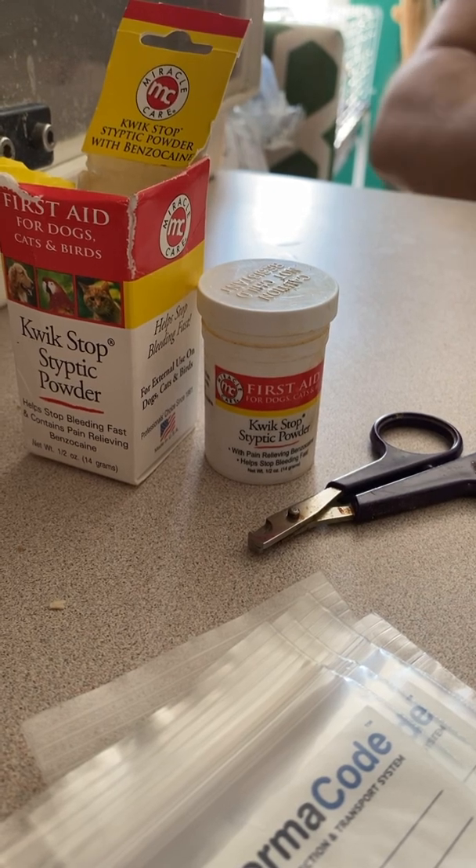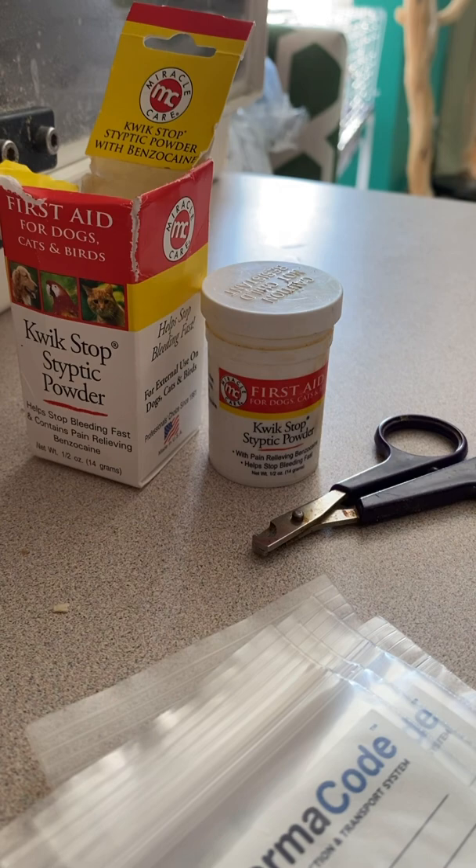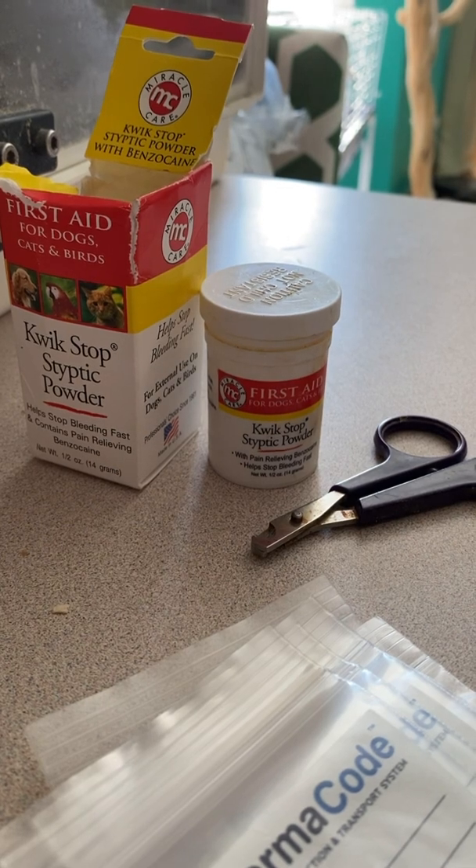Be very careful using the styptic powder. If you have any cuts yourself on your own hand, it will hurt like crazy.